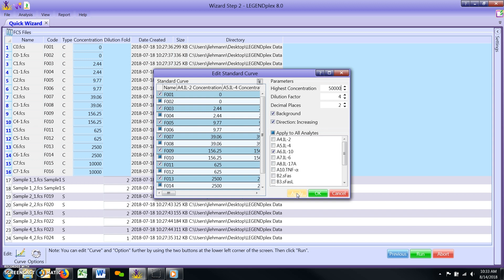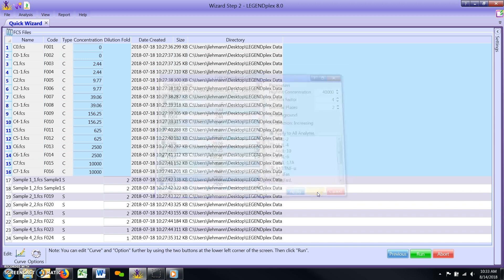Finally, uncheck the box for that analyte. Repeat these steps for each target that needs to be adjusted. When finished, click the green run button to proceed to the output report tabs.